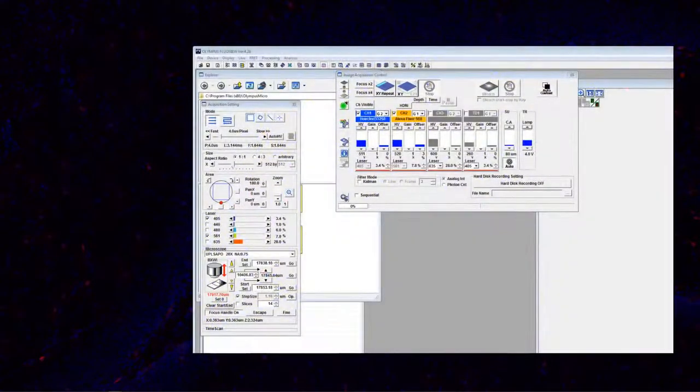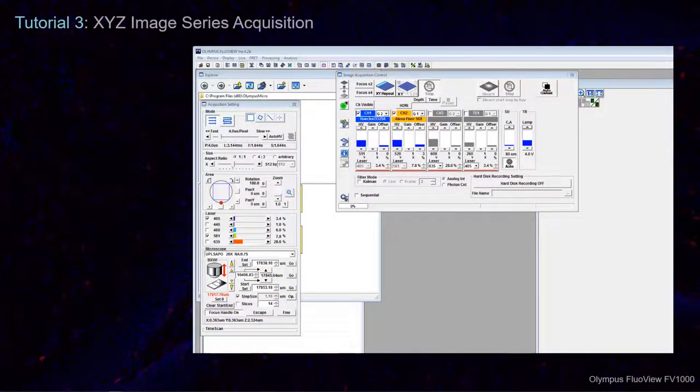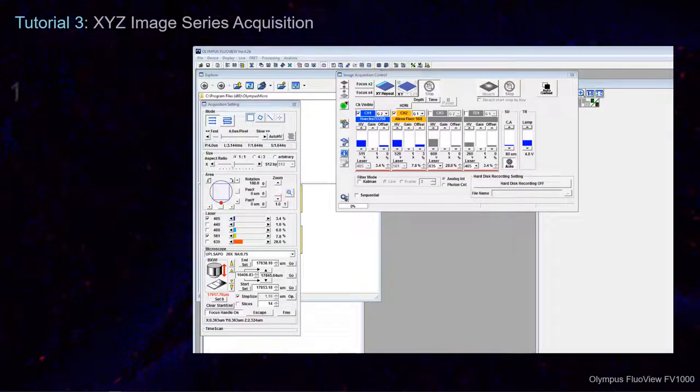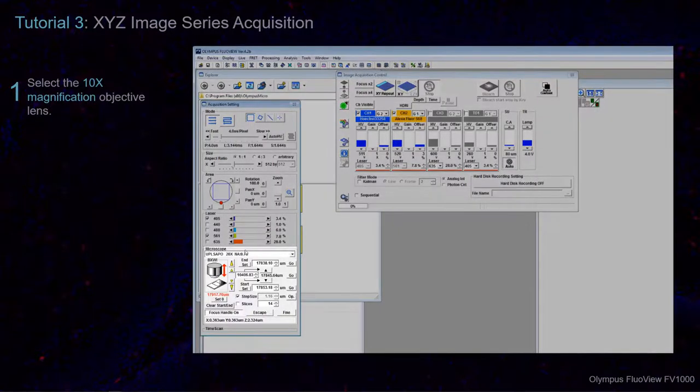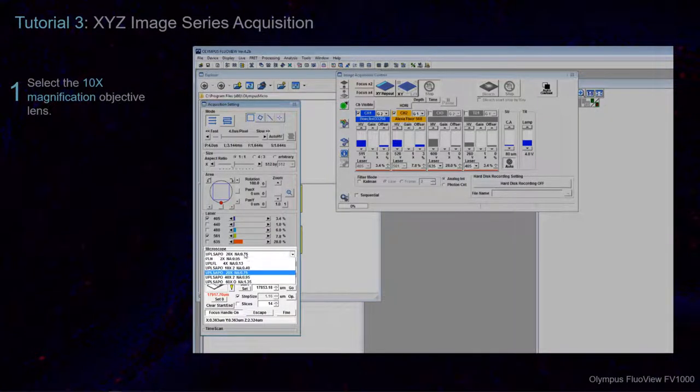After preparing the observation conditions and optimizing the live image at 10x magnification, you should already have selected the 10x option from the Microscope Acquisition Settings drop-down menu.